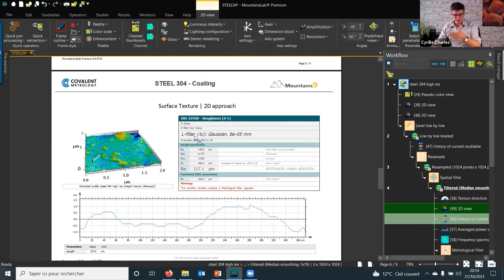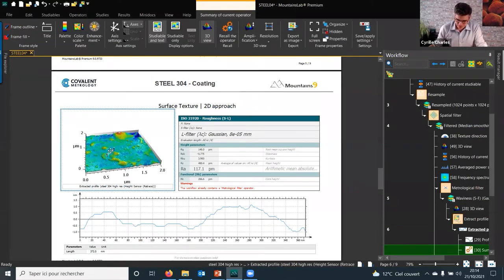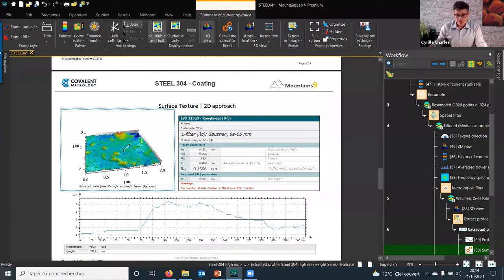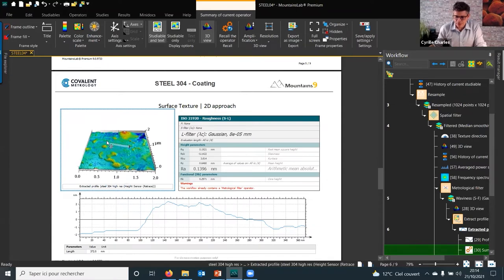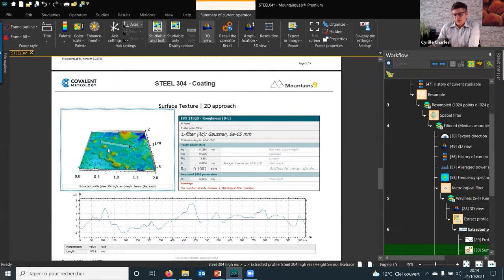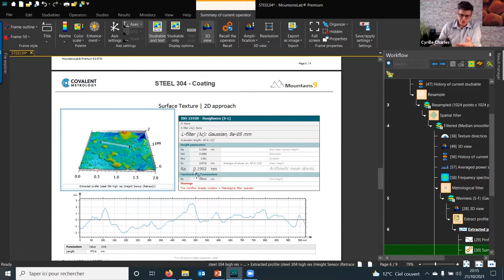The RA value is calculated using an L filter, which separates waviness from roughness, with 80 microns. What I found interesting is that if I move the profile on the surface, the profile itself is refreshed — the full document is dynamic — and the roughness value stays in the same range. If I enlarge the profile to maybe three times the original length, the roughness is still in the same range. The first conclusion is that roughness does not depend on the length of the profile.